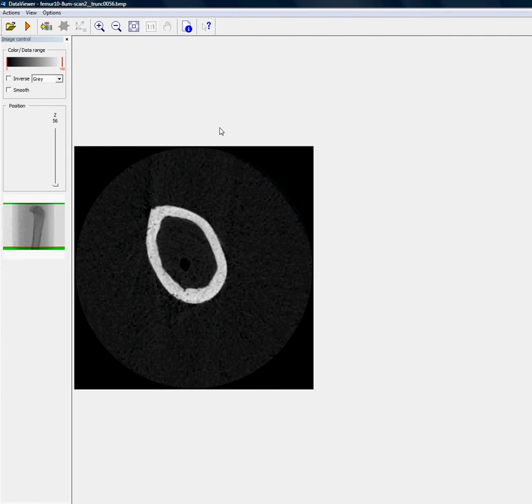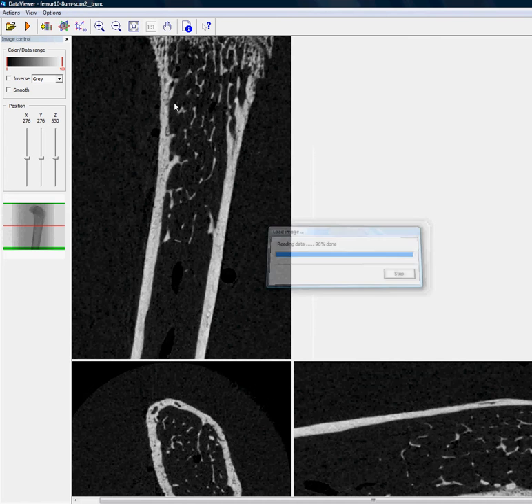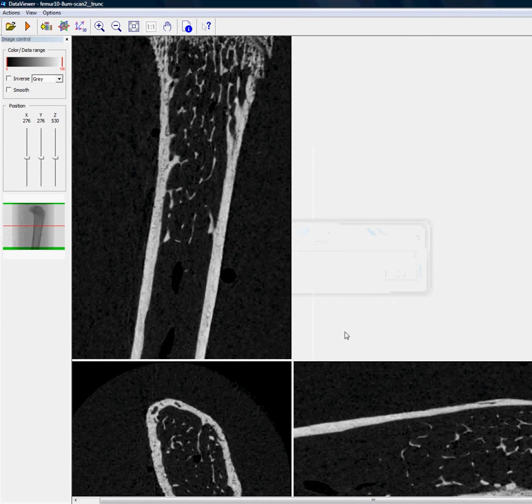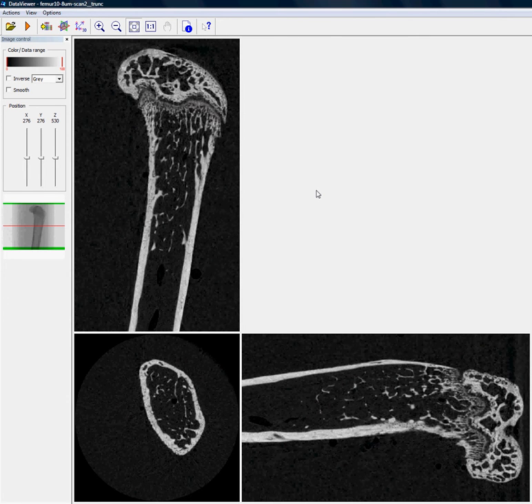After opening, click on this button here to load the dataset for XYZ viewing, and then click on this button to fit on screen. So we can see that the bone is a little bit off axis.